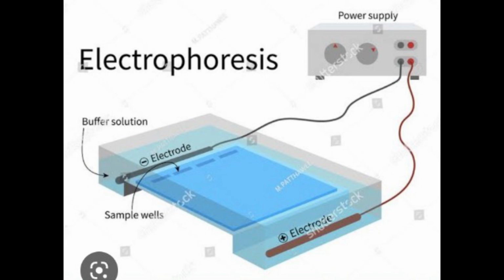Preparation of acrylamide gel. The gel typically consists of acrylamide, bisacrylamide, SDS, and a buffer with an adjusted pH. The solution may be degassed under vacuum to prevent the formation of air bubbles during polymerization. Alternatively, butanol may be added to the resolving gel after it is poured, as butanol removes bubbles and makes the surface smooth.